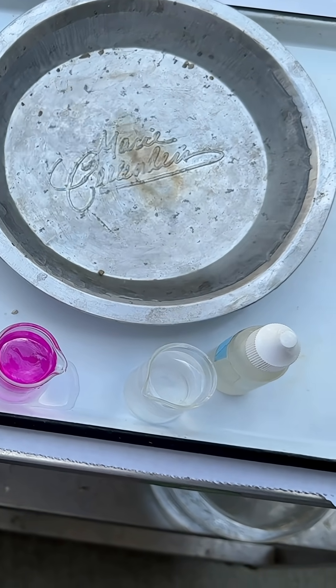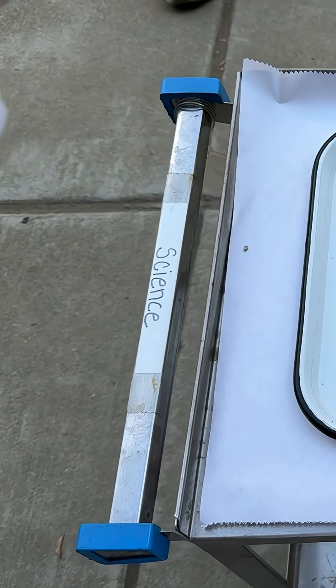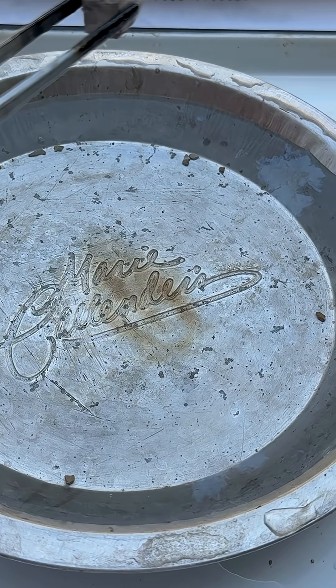So let's put a couple drops in here. All right, are we ready? Anyone want to drop it in? You want to drop it? Yes. Okay, once you drop it, immediately step back. You ready? Drop and go.